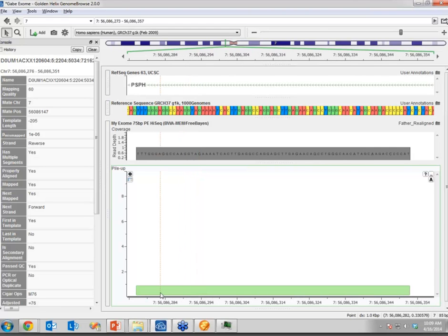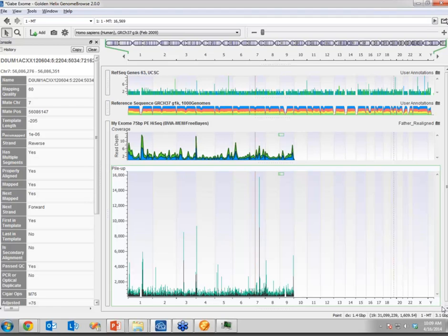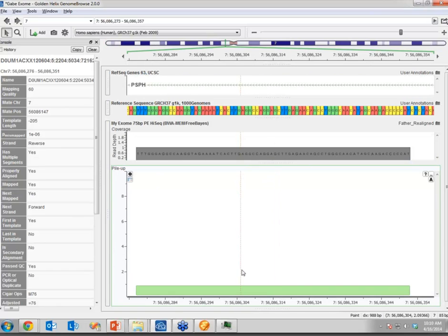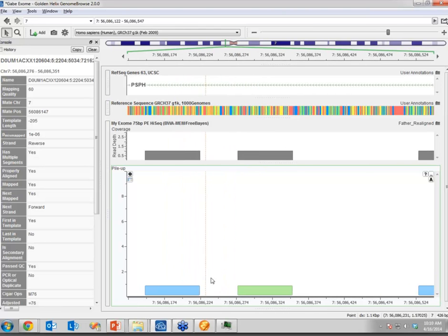The other thing to keep in mind, though, is even as this looks like a relatively simple mapping, it goes straight to the human reference. The human reference is massive. If I jump out to the whole genome view, this human reference is 3.1 gigabases, billion bases long, and I'm trying to map just this individual read into this one little portion of this chromosome. So now I'm just jumped on back with my navigation buttons to get back to here.